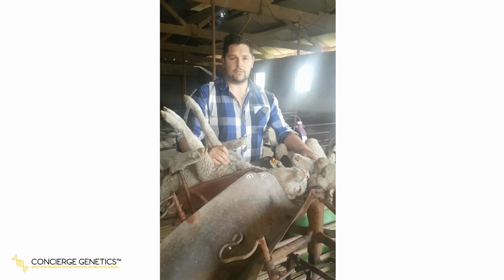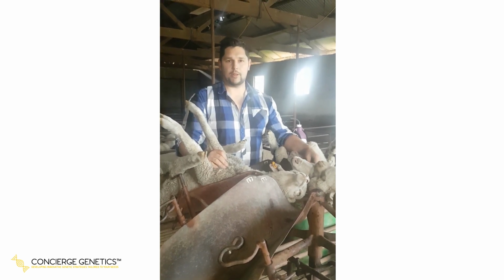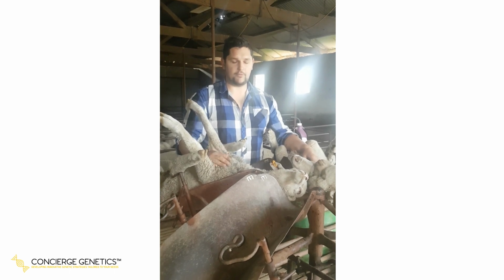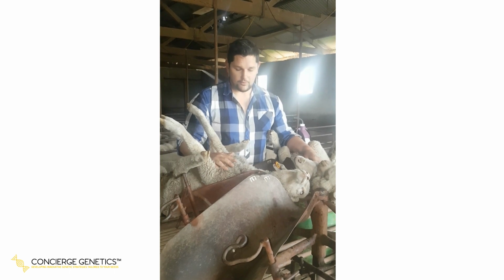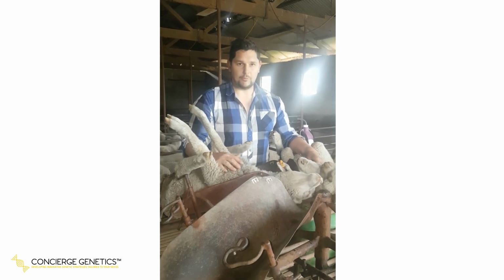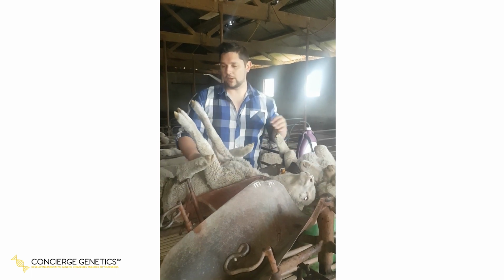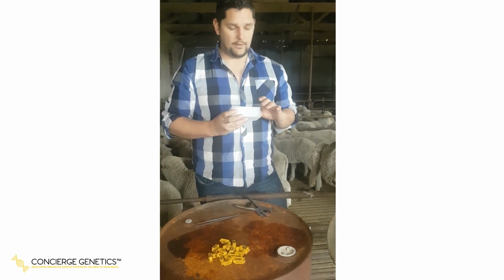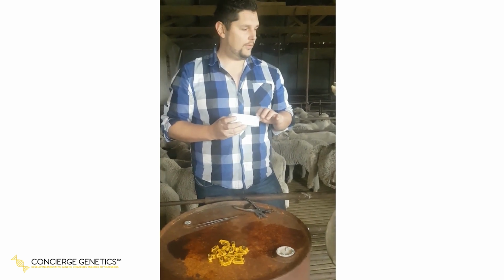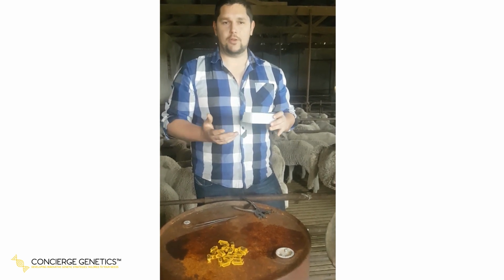throughout their entire life, and you can match up with their phenotypic data, so their weights as you weigh them down the race, what their fleece weights are over the years. One of the other things is the genetics of the animal stay the same through its life. So once we've done this single test, we put it in this plate. That's a barcoded plate, and every individual is known from its birth to death, and we can manage the entire flock.